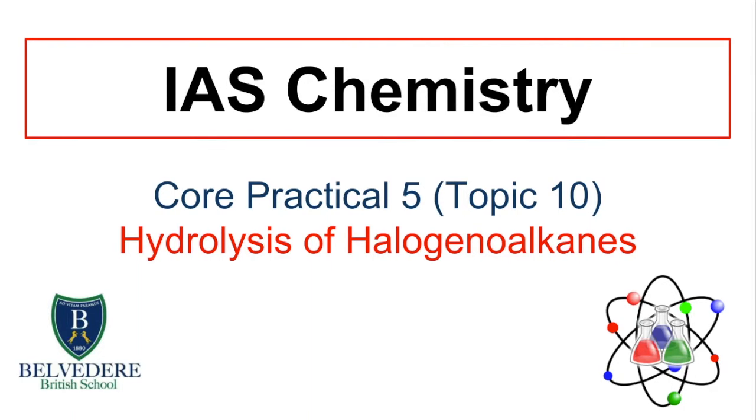So this video is going to be looking at core practicals 5 and 6 for the Edexcel IAS chemistry course. We're going to be looking at the organic core practicals, so all of them coming from topic 10. So the first core practical is number 5, which is the hydrolysis of halogenoalkanes.